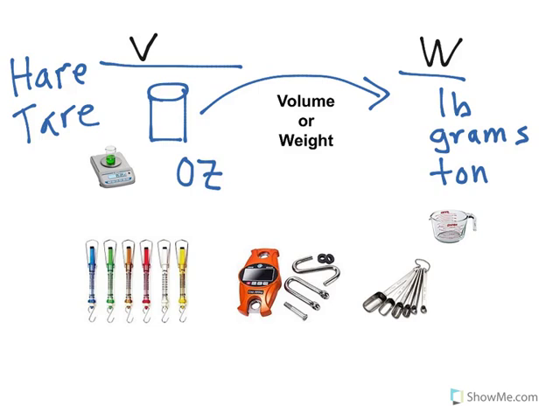Make sure you write the units down, because 2 doesn't mean anything. But 2 hogsheads of wine makes sense to me, or 2 pounds of fish makes sense to me. So make sure that you write the units down. And then also be aware of where the decimal point is. If it's 1.2 pounds, that means you're measuring within 1 pound; your sensitivity is smaller than one pound. Always write down your units and the decimal points.